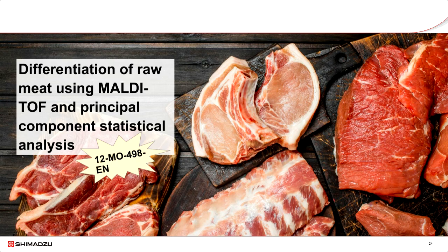In the fourth application of this webinar, I'm going to show you how MALDI-TOF MS combined with multivariate analysis can be used to differentiate different types of meat to pinpoint a meat adulteration. An application news is available for this application.